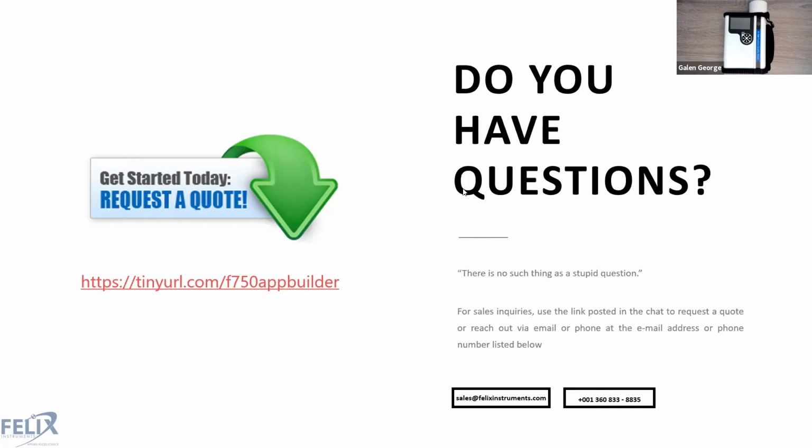There are instructions for this in the user manual if you want to use the tool to wirelessly upload a grouping of data. After you took a day's worth of data, you can wirelessly upload all of it by archiving it, and the archive will automatically send it to your particular data server. It'll also store it on the SD card in a separate folder.